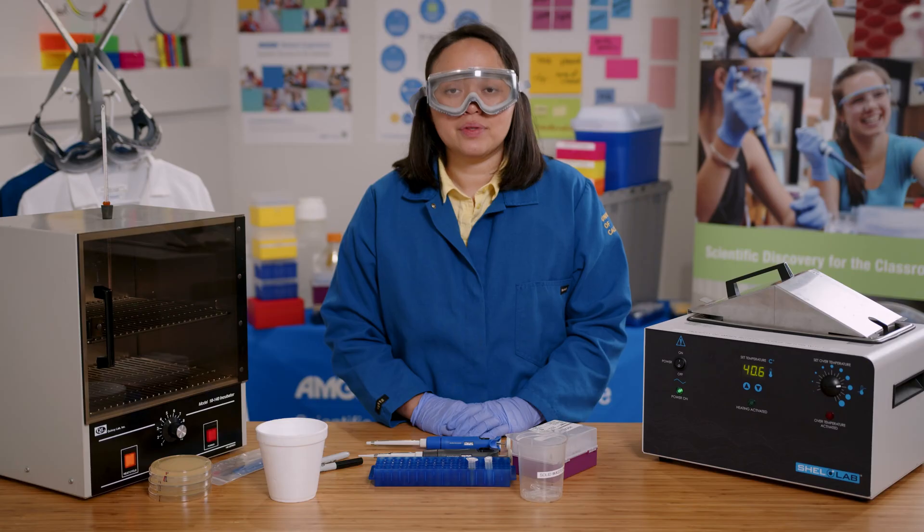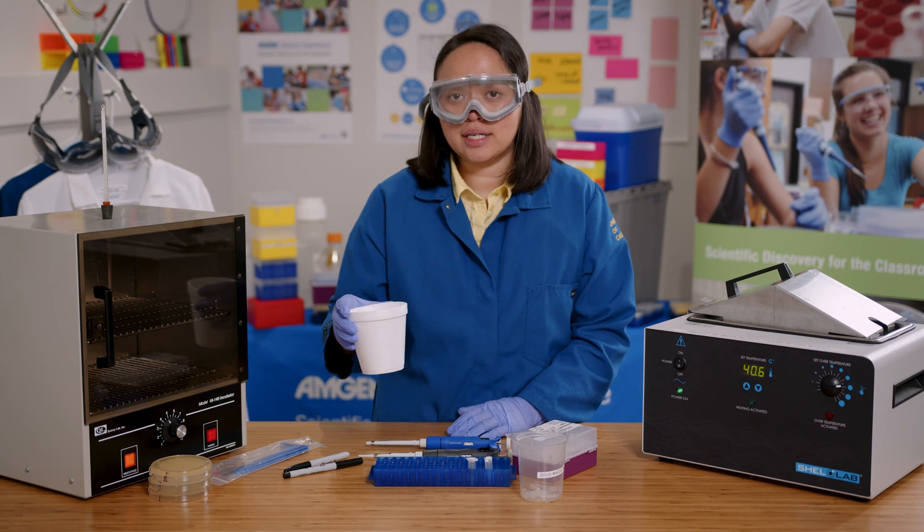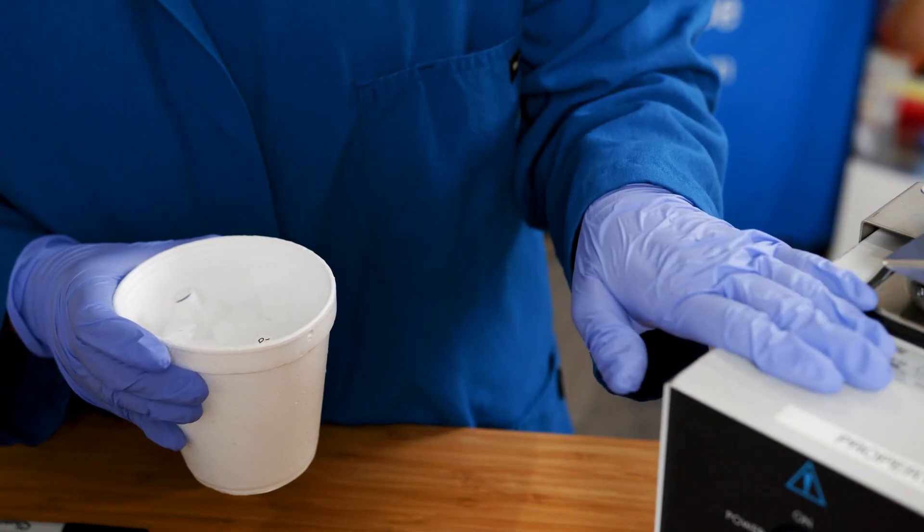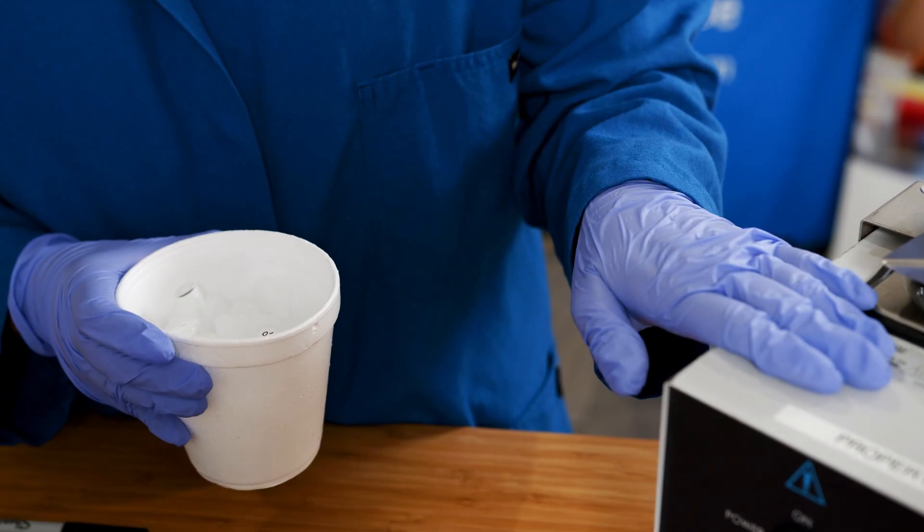Then I'll let everything sit on ice for 15 minutes. Now I'm ready for the heat shock procedure. I'll keep everything on ice until right before it goes into the water bath. It'll be in the water bath for 45 seconds, so I'll need to have the timer ready.